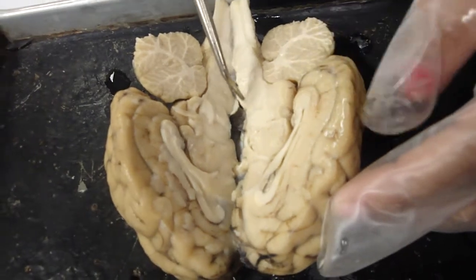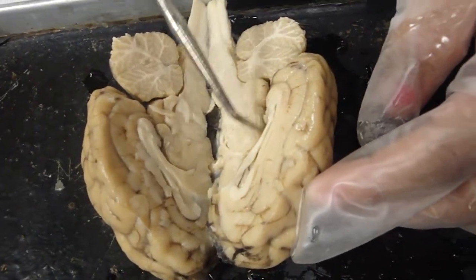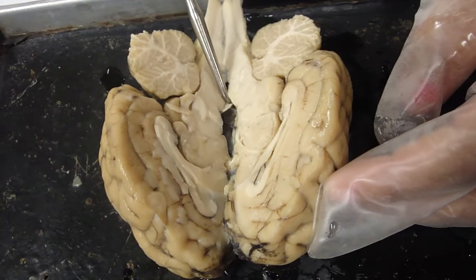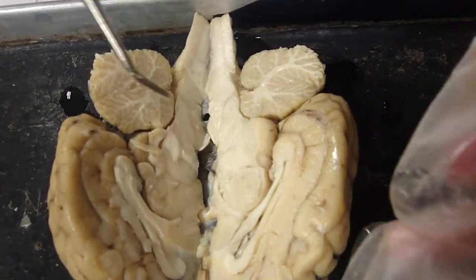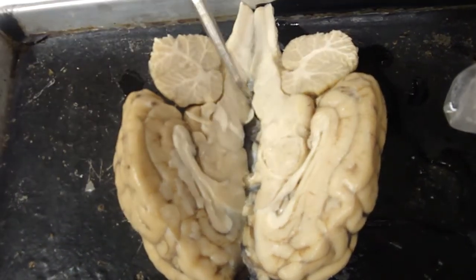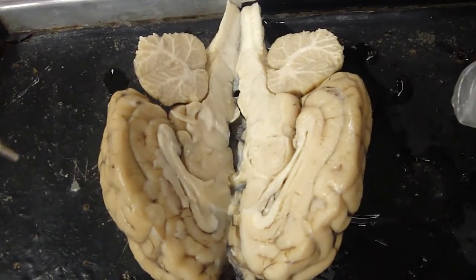The pineal body is quite a bit larger in a sheep than it is in humans, relative to the proportional size of the brain. It's this other round structure right here. On this half of it, we slice through it by making a sagittal section. Corpora quadrigemina actually means four bodies. There are four structures that make up the corpora quadrigemina. There are two superior colliculi and two inferior colliculi.